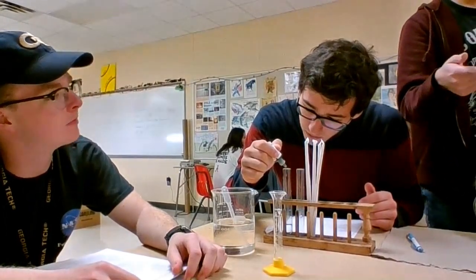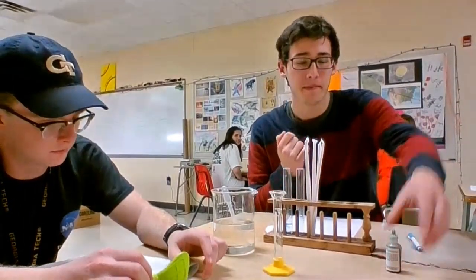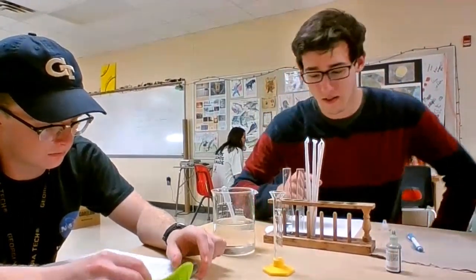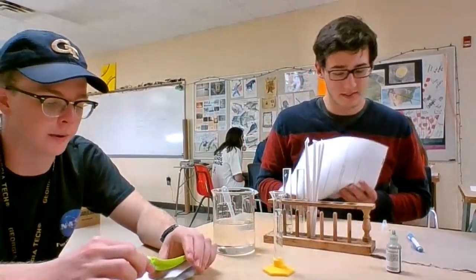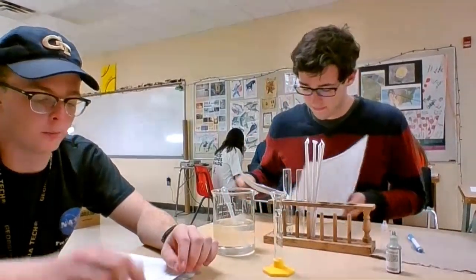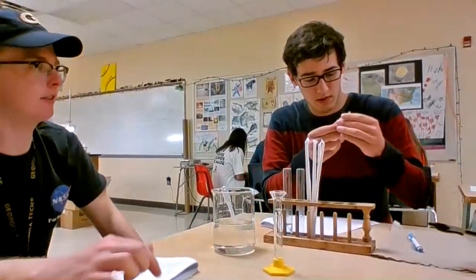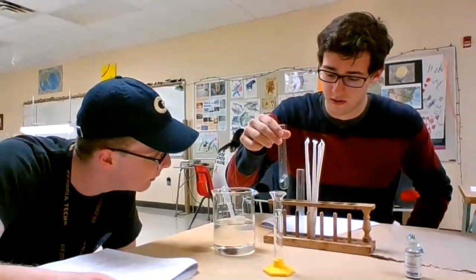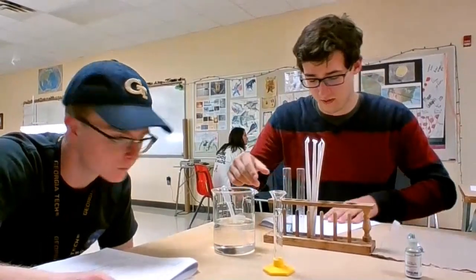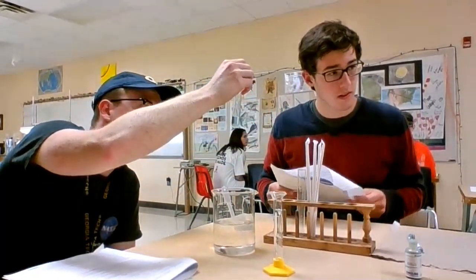We're activity 3, he said. Oh, 3. We didn't get another set of goggles. Rotating station. Okay, now what? Acid rain on human. Determine if the pH of the water is acidic or basic. Bromothymol blue is blue at or above pH 7.6, and you get yellow at or below 6. This is the one where you blow with the straw. Exhale gently through the straw. That's activity 1. This is station 1.